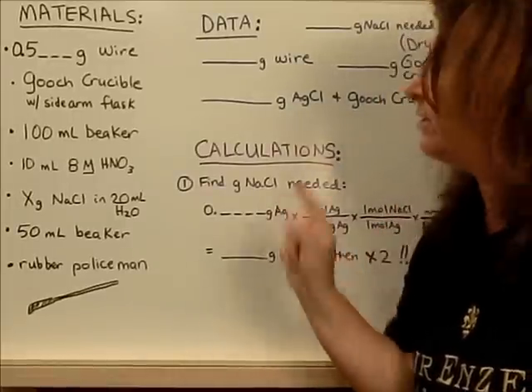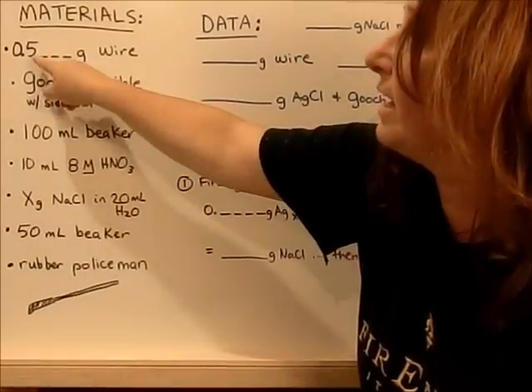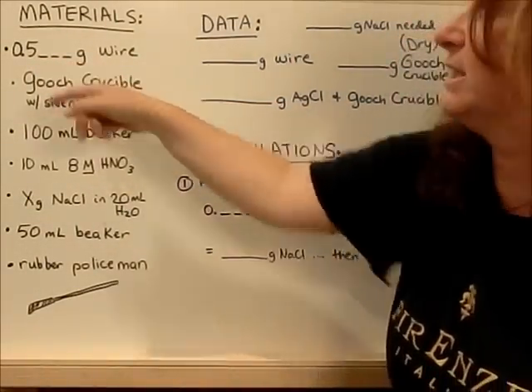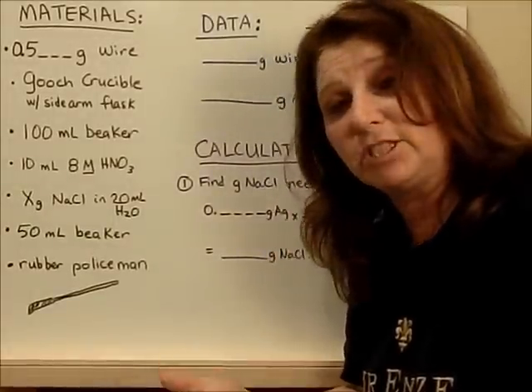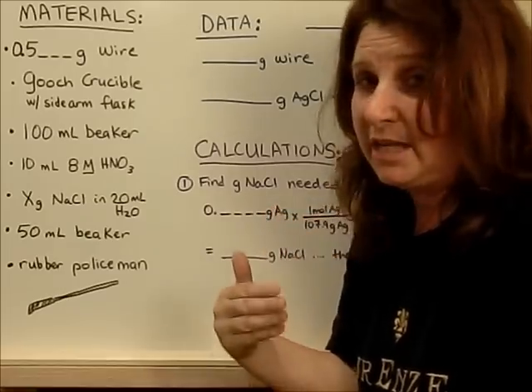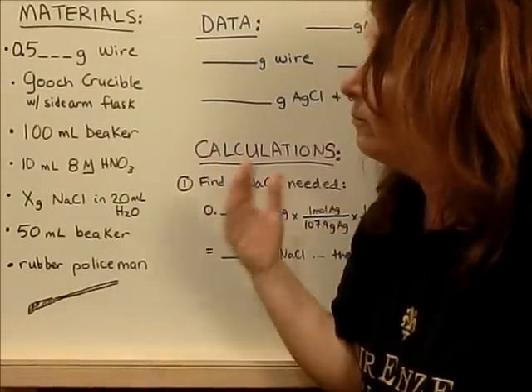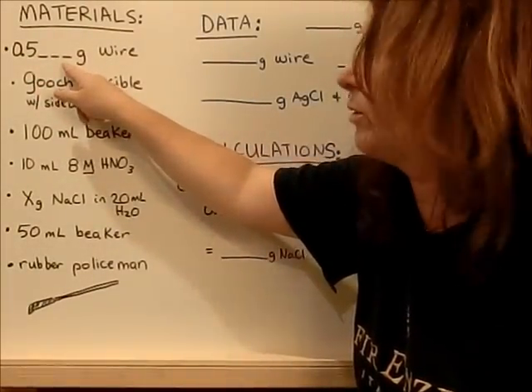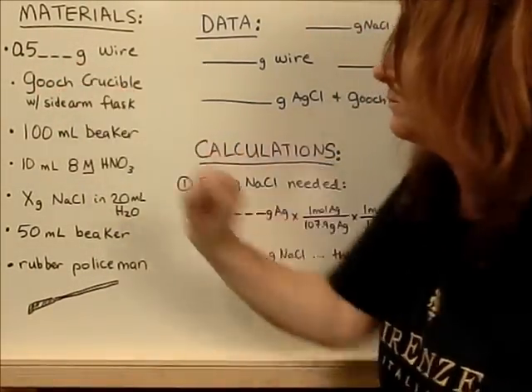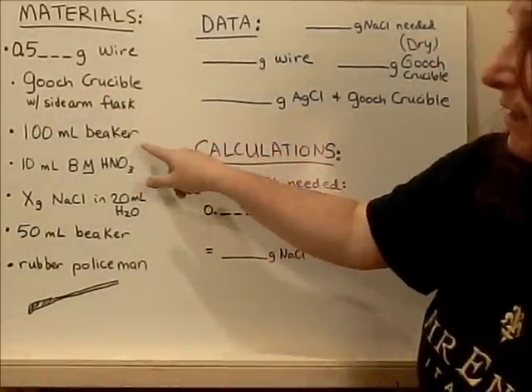So let's start with your materials list. You'll need a wire. Now I've put 0.5 dot dot dot grams because you need about 0.5 grams, but you don't know exactly how much it is. You don't have to have 0.5000 gram wire. You won't get that. But what you do need to know is how much of it you do have. You do need to know it out to the 10,000th place.